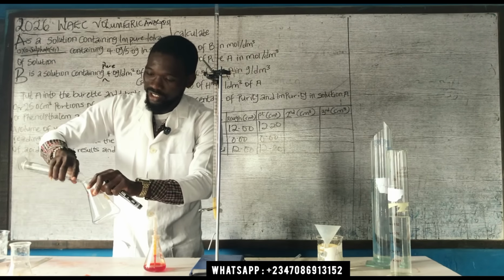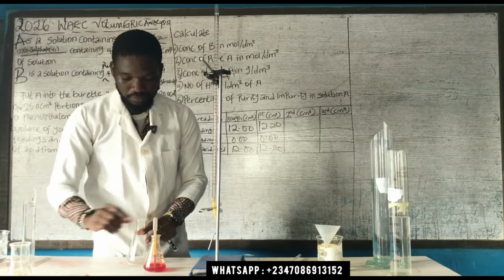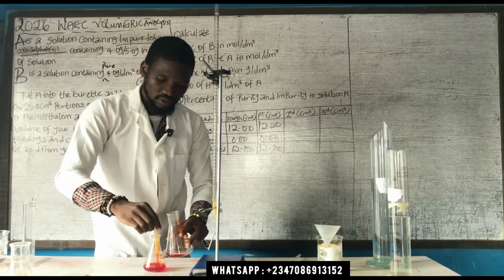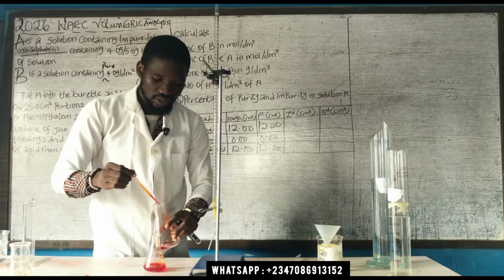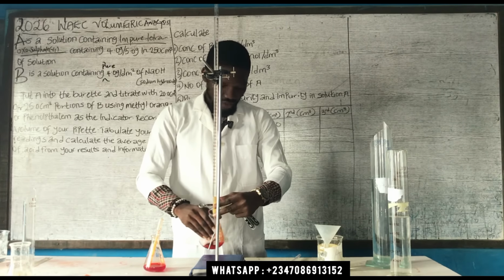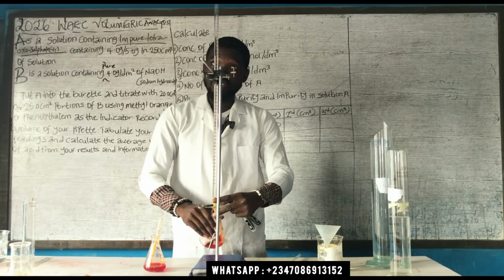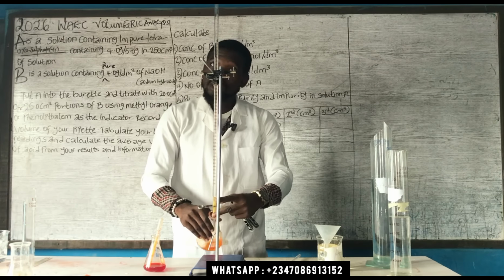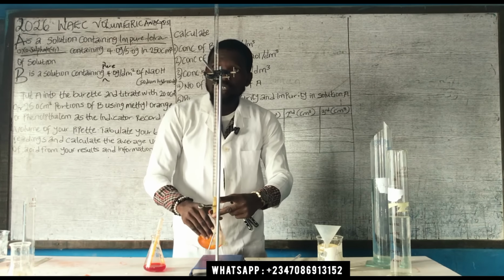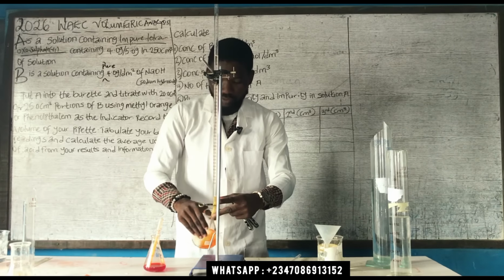So here is the third conical flask. Just keep shaking until you have your end point. Okay, for this, I have 12.30.